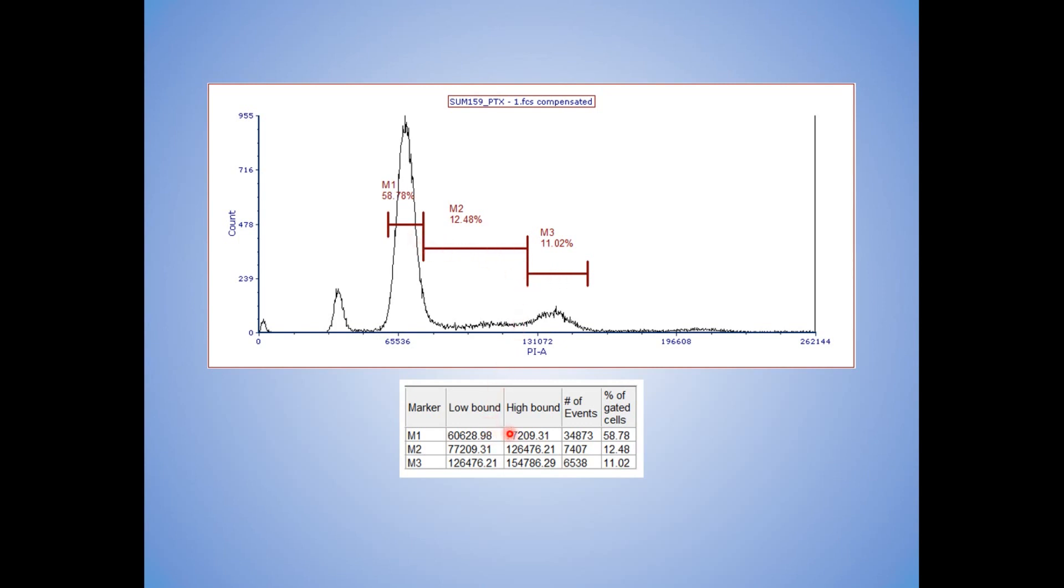But FCS is really good about telling me where my bounds are so I can try to accurately, OCD style, put these regions where I need them. And some of you might say, wait a minute, I'm not thrilled with this one. This margin could come in just a little bit or maybe this one needs to go a little more to the left. Welcome to subjective region analysis. There's one reason we don't want you to do this.